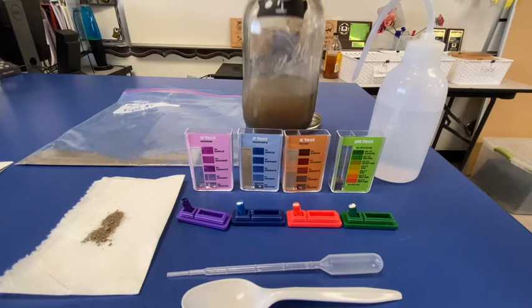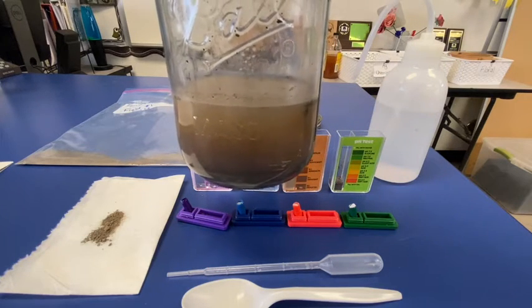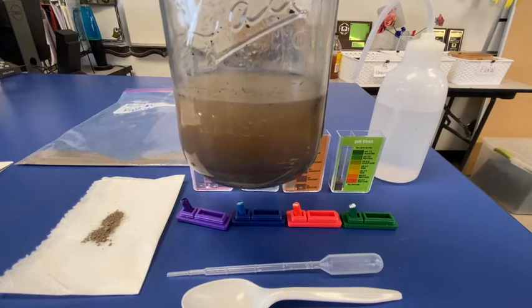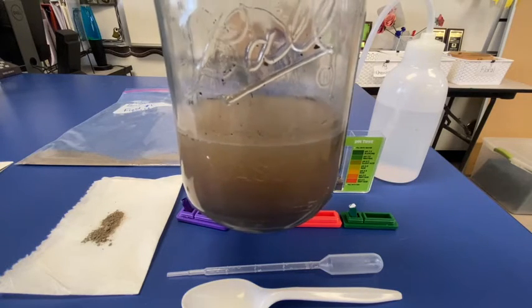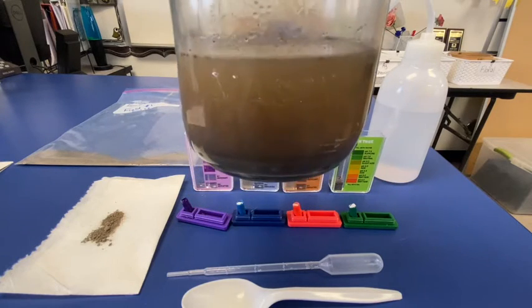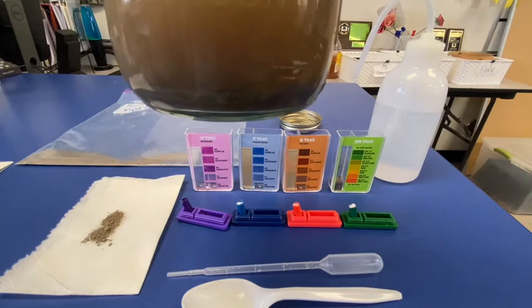This is our soil profile after 48 hours. This is from field number one. That soil, after we shook it — as you can see from the previous video — this is after 48 hours. We can see on top we have some floating organic matter, such as dead leaves, dead plants, dead animals. In the center we have that lighter color water, and on the bottom we have our sediments that have been sinking.